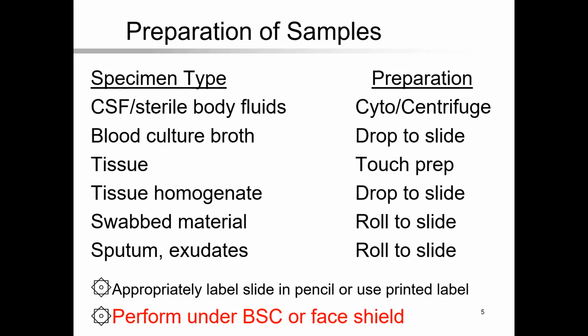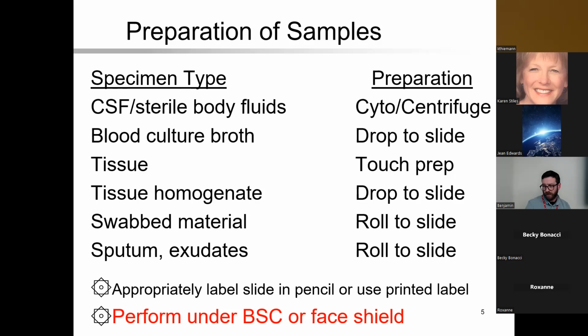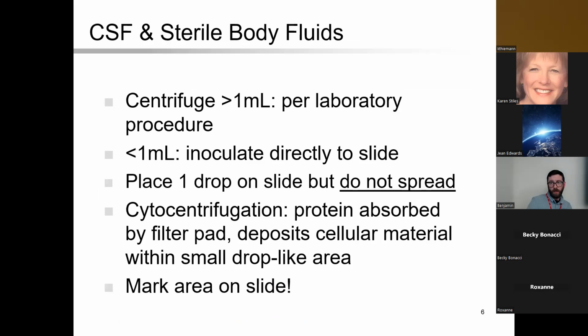And then at this point in the procedure here, we're going to perform all of this sample preparation under the BSC. We don't know if these samples are positive or what the causative agent could be, so be as careful as possible, right? So here we go, CSF.